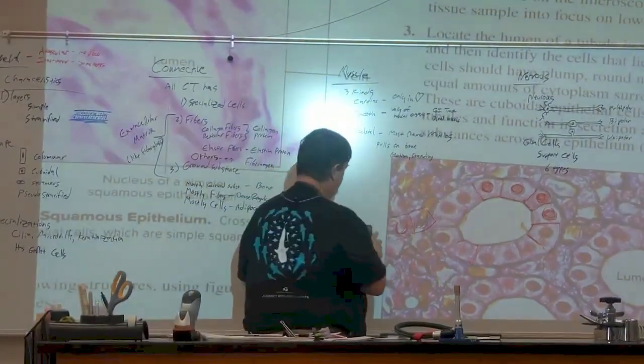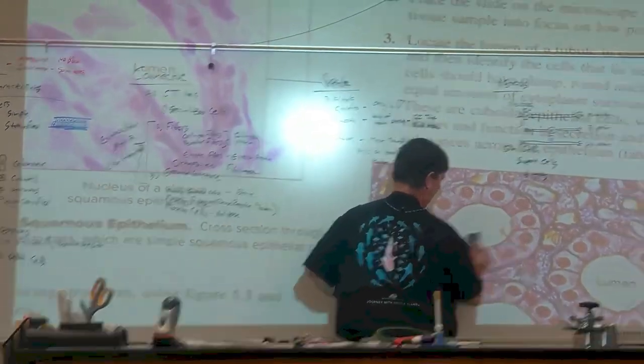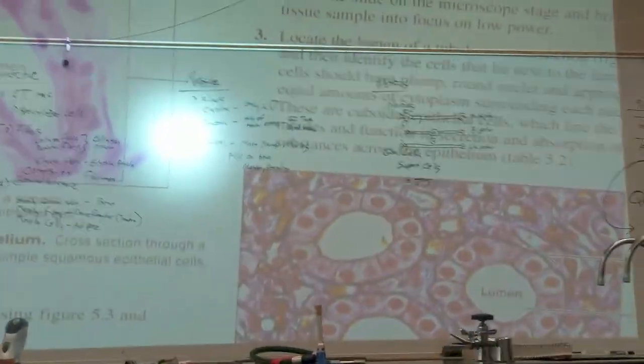The next one we're going to talk about is squamous. All right. And squamous is super easy. It's probably my favorite one. Yes, you're allowed to have favorite cell types.